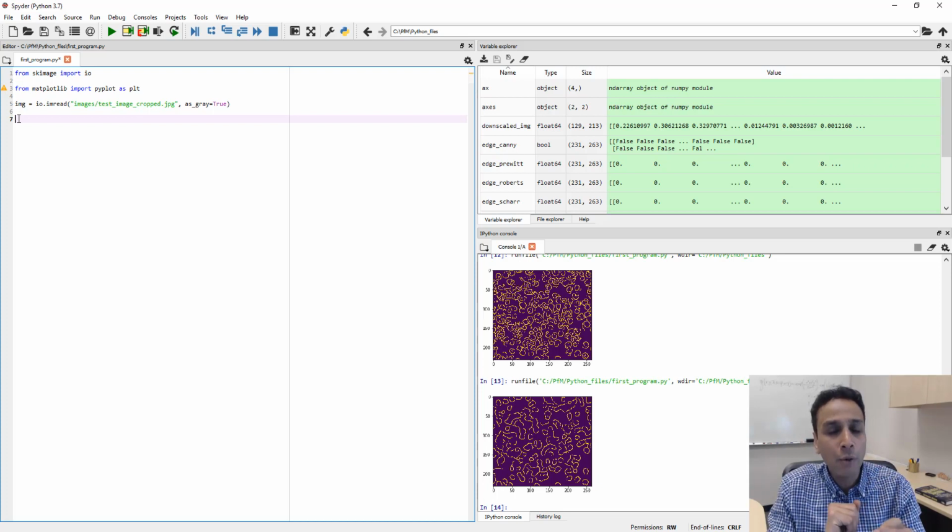But if you know how that halo is formed, then you can take all those pixels and put that intensity back into the pixel where it should belong. This is what deconvolution is. And the way this halo spreads is called the point spread function.